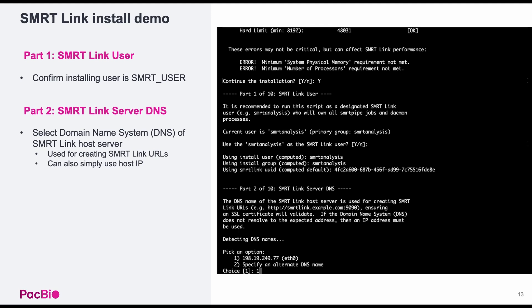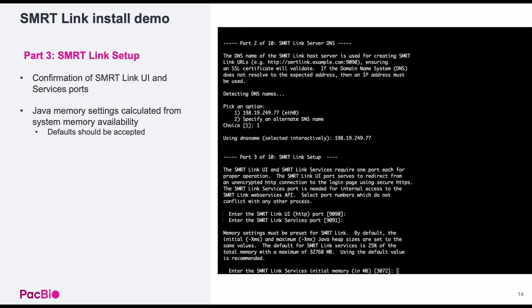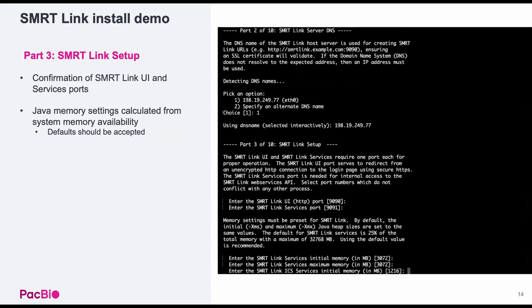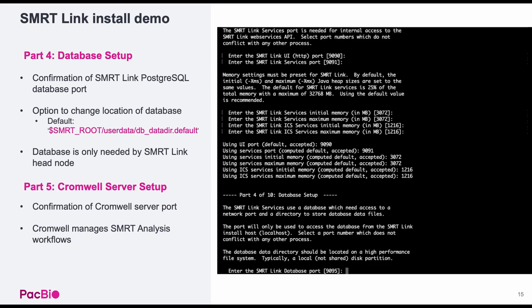Part two is choosing the SmartLink server's DNS name. A list of options may be presented to you to choose from, or you can specify an alternate name. I chose to use the direct IP address instead. Part three is setting the SmartLink UI and services ports. Again, the defaults are shown in square brackets and can be accepted by pressing enter. This section will also automatically calculate Java memory settings based on the system memory. We recommend accepting the defaults here.